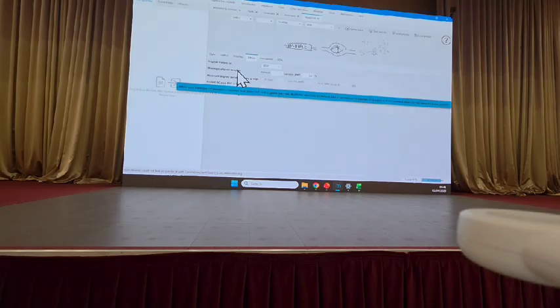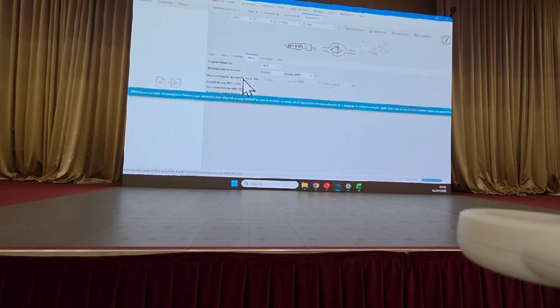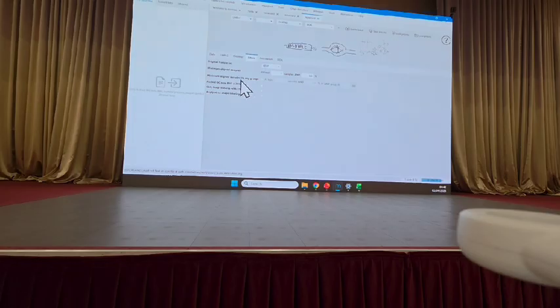Minimum aligned samples. So we are running everything in triplicates of the same species. So we expect if we find a metabolite in one sample, since we're doing biological replicates, 3 different leaves, we expect the same metabolite to be found in the leaf each time if it's coming from the same species. So what we could put here is 3.